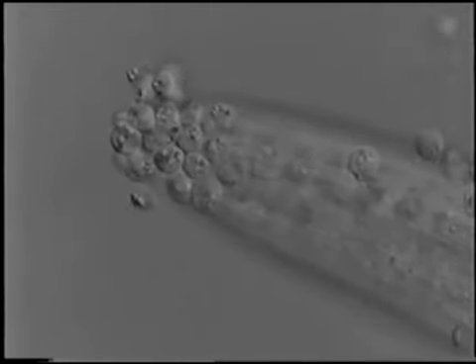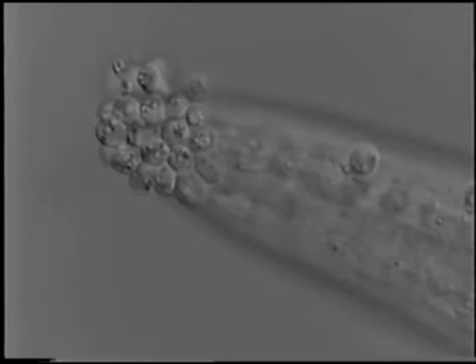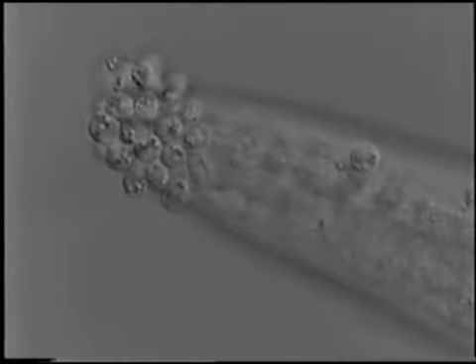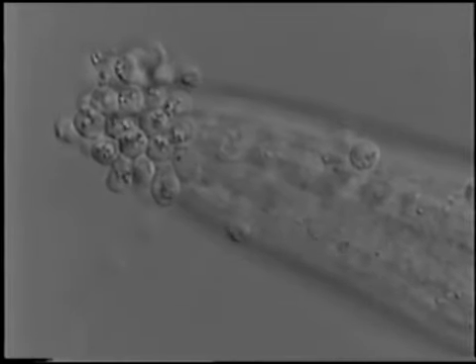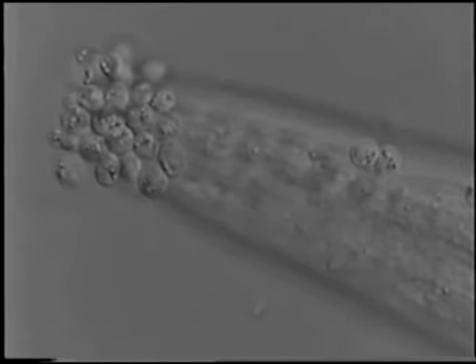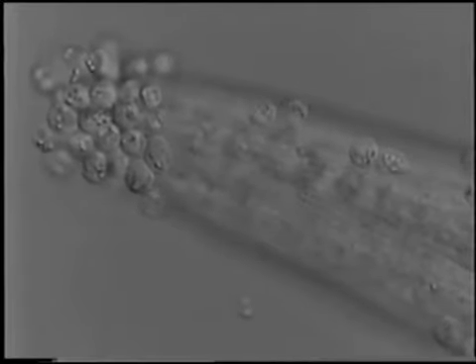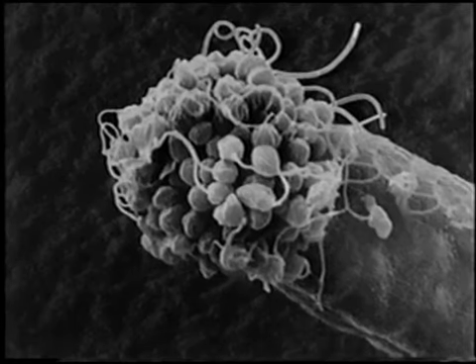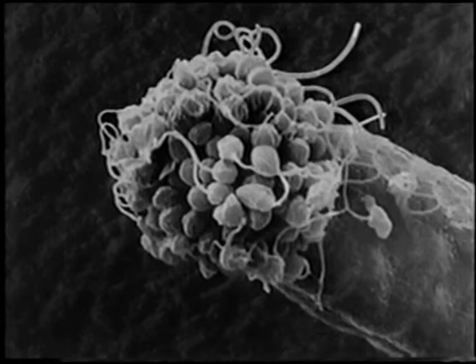After contact, the zoospores produce an adhesive, withdraw their flagella, form a cell wall, and become attached to the surface of the host. From the encysted zoospore, a germ tube is formed that penetrates the nematode. The same situation seen in the scanning electron microscope. A few zoospores still have their flagella, while others are already encysted.